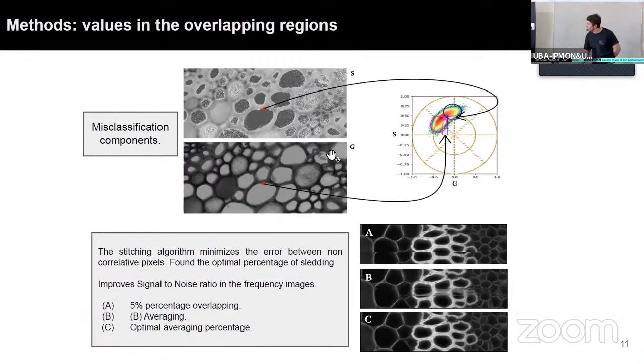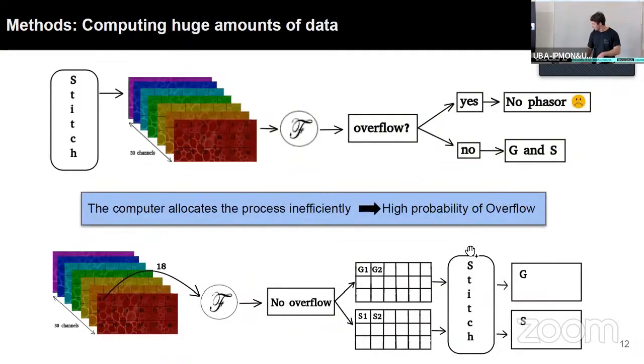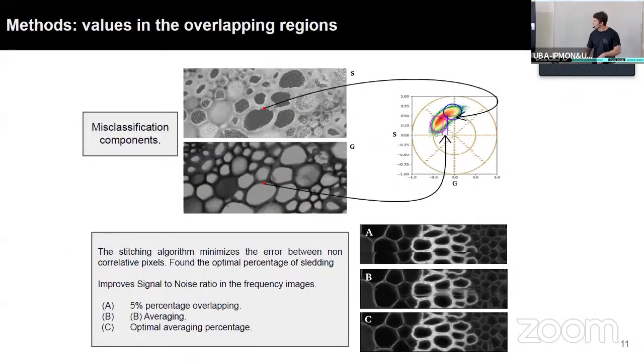So to overcome that, we developed some algorithms. This is the first image you acquire, which has the repeated information, the redundant information. This is the first approach we did, that you can see has some ghost effect on the image here. Can you see the pointer? Okay. And this is the optimized algorithm, in which you don't see this kind of effect.